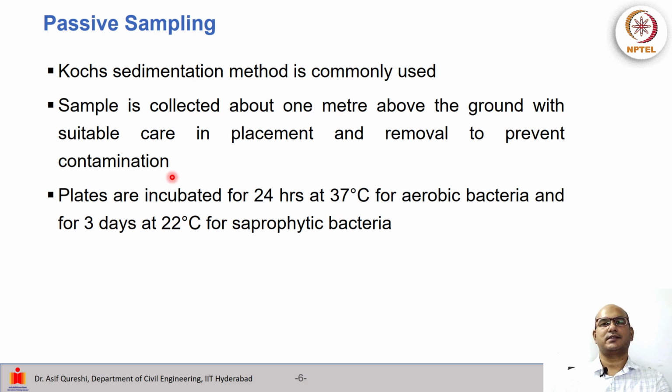Once the sampling is over, whether 1 day or 1 hour or 1 week, the plates are taken and incubated for 24 hours at 37 degrees Celsius for aerobic bacteria, and for 3 days at 22 Celsius for saprophytic bacteria.